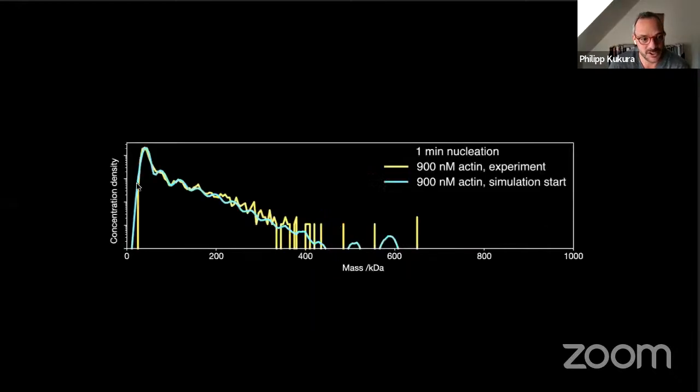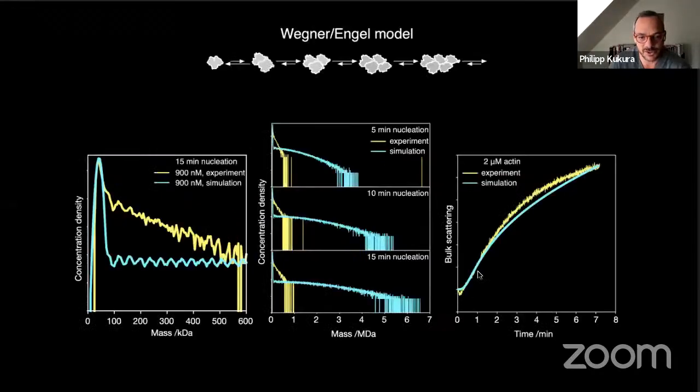And then what we did is we modeled the distribution. So the green, I'm sorry, I'm colorblind, I should use better colors for myself, is a simulation, and the yellow is what we have. And then we run a kinetic model and see what happens. Now here's your traditional experiment that we discussed before, plus the simulation with an existing model, and you see a decent fit. Yes, I get filament formation.